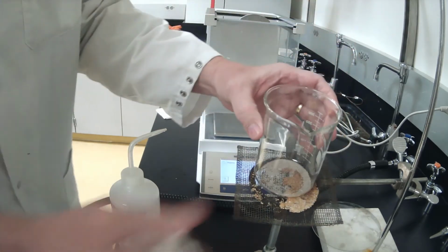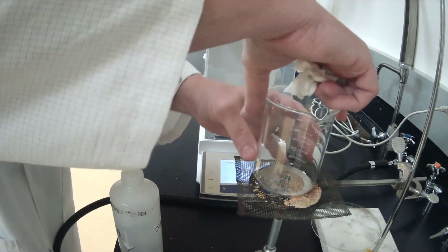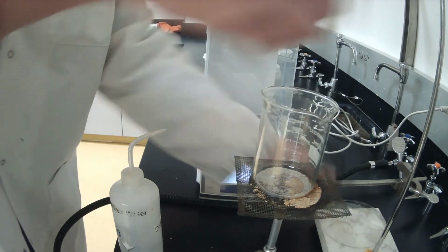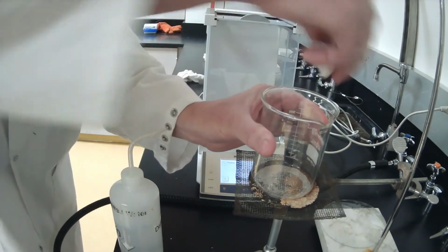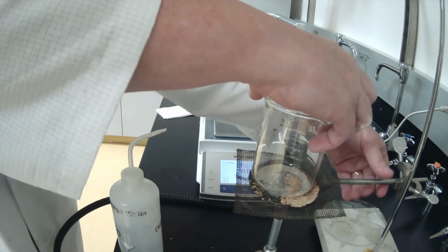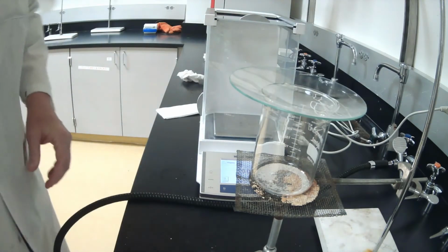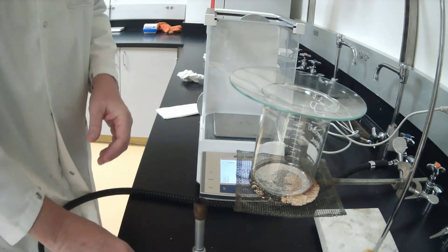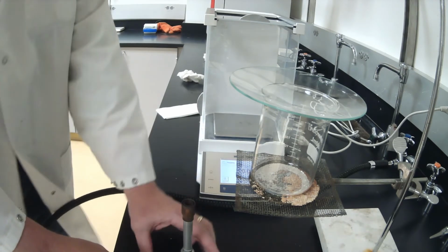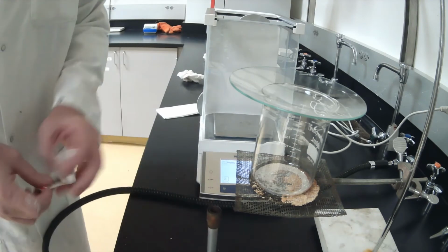Okay, we have now removed the ammonium chloride, and we're ready for our second and final heating of this mixture. Want it as clean as possible. Okay, so we're going to relight the Bunsen burner. Just to make a comment, if we've adjusted nothing, we should be in the perfect flame that we turned it off at. I'm going to show you the other lighting technique, which is done with the matches.